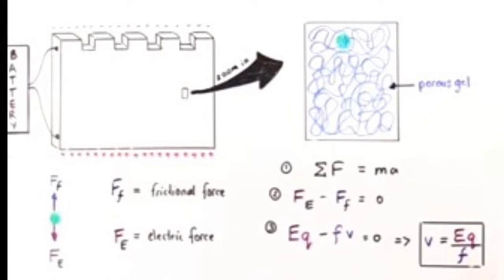Now, this is how it works. Once we put a protein, or a substance, in here, maybe let's say we've put it in number 4, and then we've connected this to the power source, electrophoresis has started to take place.